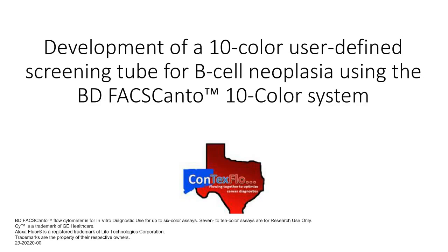Sure. In our lab, we pre-incubate the cells at 37 to permit endocytosis of any bound immunoglobulin, which lowers the background tremendously when you then come back and add your labeled anti-kappa and lambda.